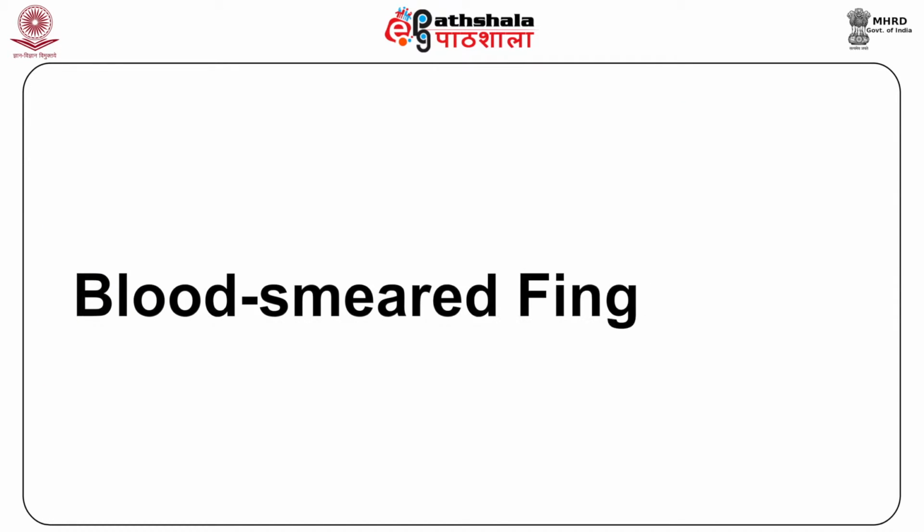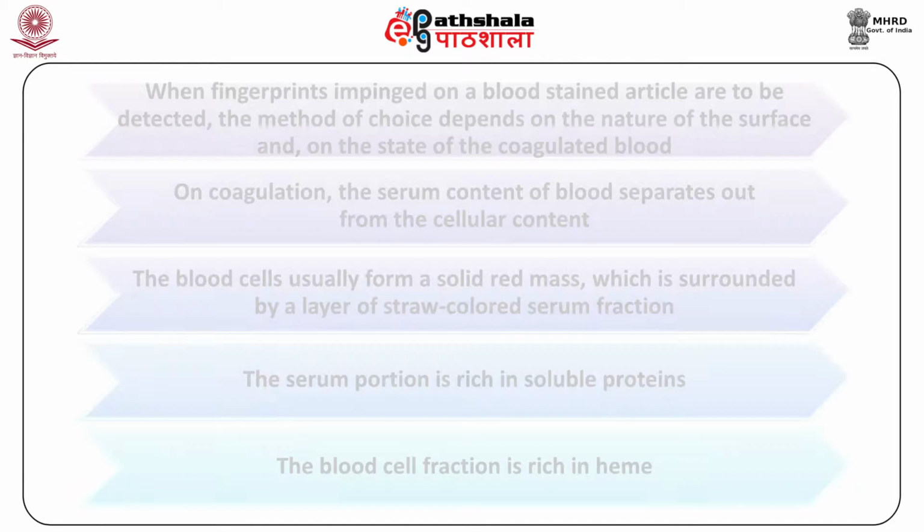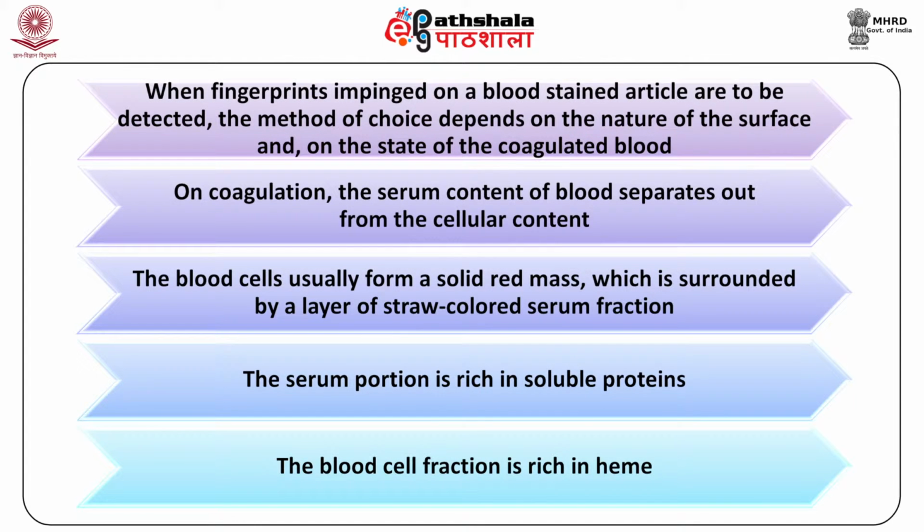Let us have a detailed look on blood smeared fingerprints. When fingerprints impinged on a blood stained article are to be detected, the method of choice depends on the nature of the surface and, more importantly, on the state of the coagulated blood.